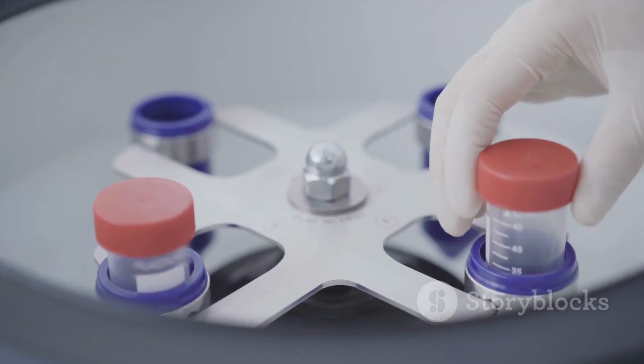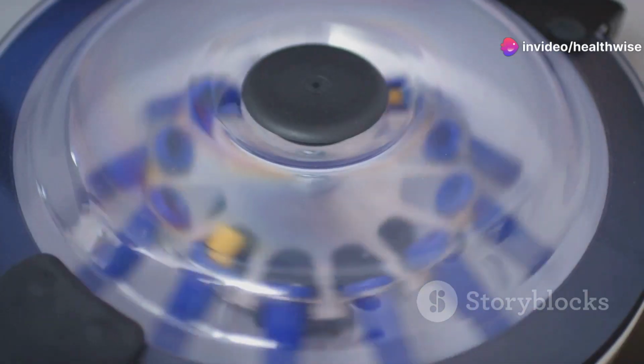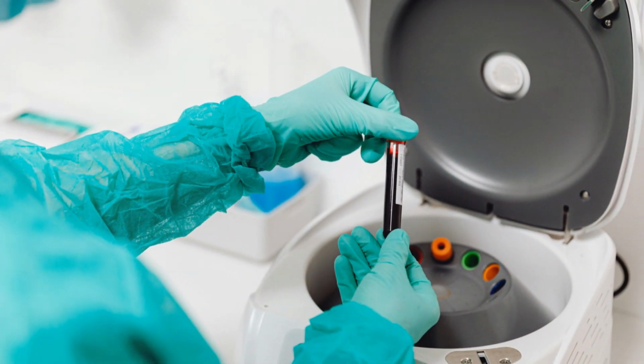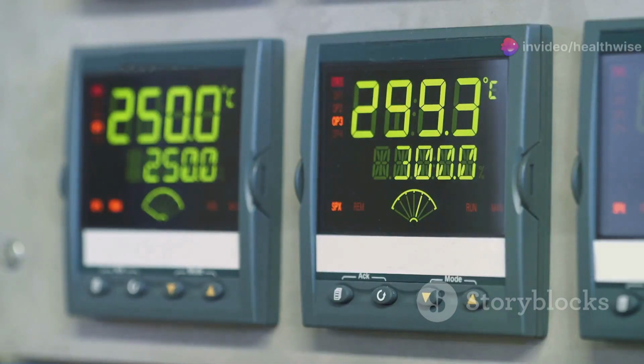Speed check. Periodically check the accuracy of the centrifuge's speed using a tachometer. This ensures that your centrifuge is spinning at the correct speed for your experiments. Temperature control. If your centrifuge has a refrigeration system, make sure it's functioning correctly. Check the temperature regularly and calibrate it as needed.